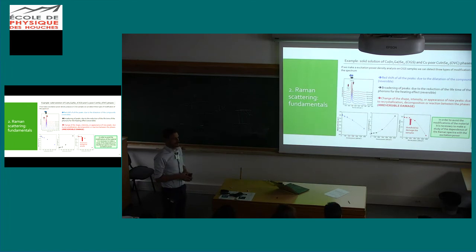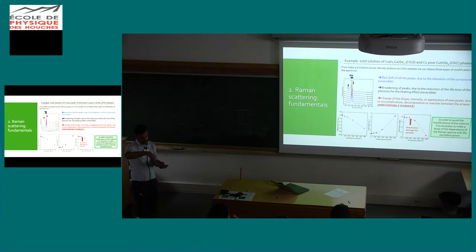Yeah, you can use macro Raman that uses a really larger spot, but normally the signal drops a lot. So what we use is a small spot, but we scan this spot in a larger area. Then we have a very good statistic in 50 by 50 microns easily.